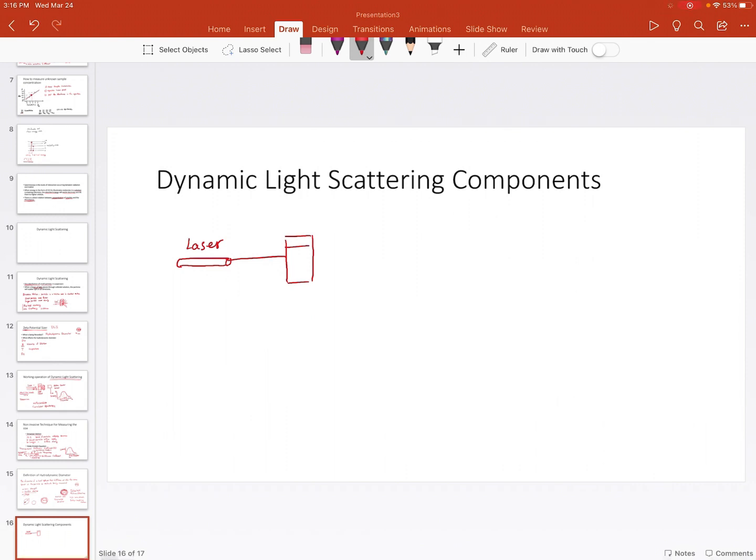We even have low volume cuvettes that take 2 microliters of a sample, and that's when you have a very small volume of a sample and you want to measure the size distribution of particles. You don't have more sample. There are actually cuvettes that can hold this small volume of sample. The standard cuvettes that we use will take 2 or 3 ml of solution.